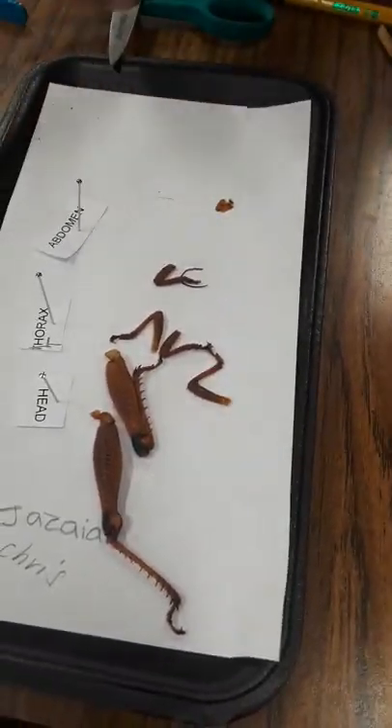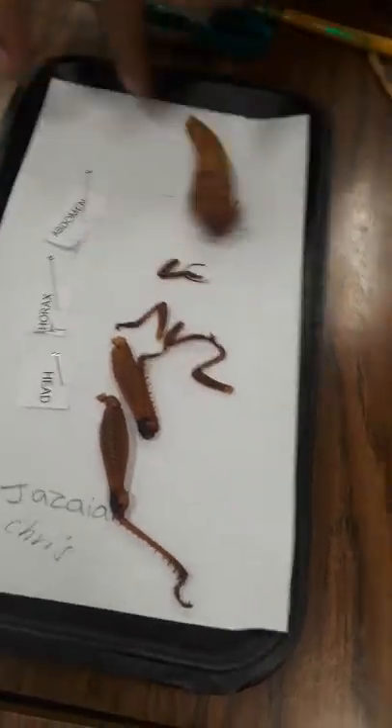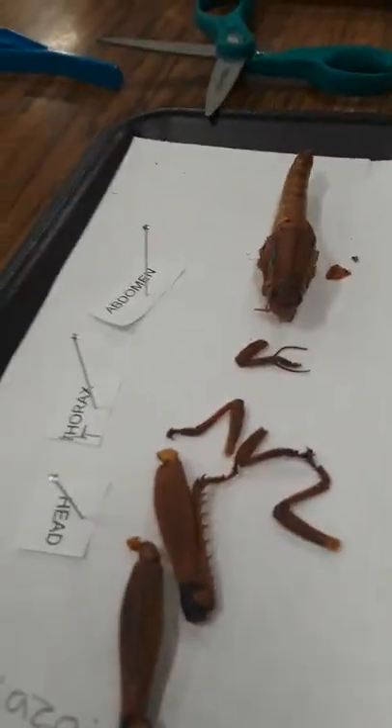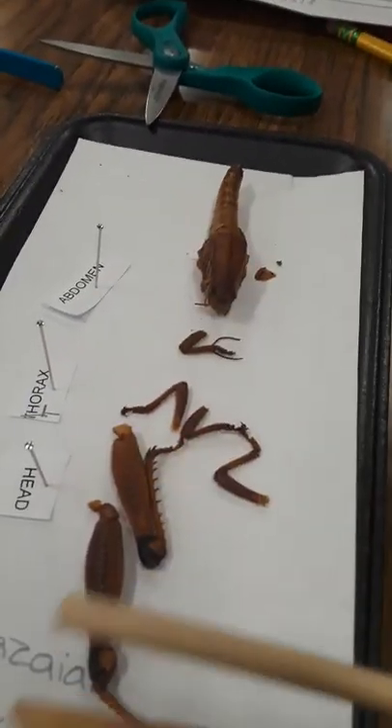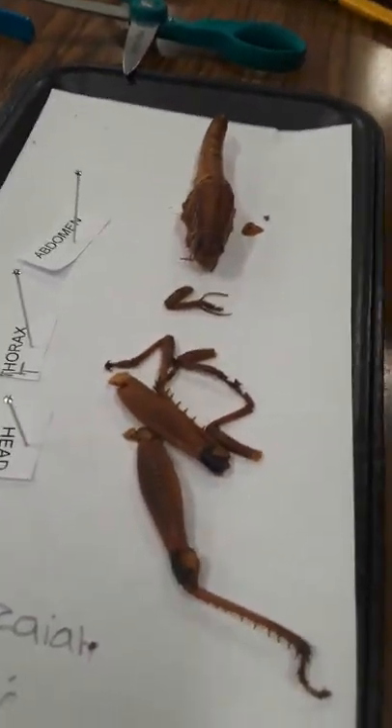Wow, look at that. Put all the legs off. I'm posting this, I hope you know. We got the legs.